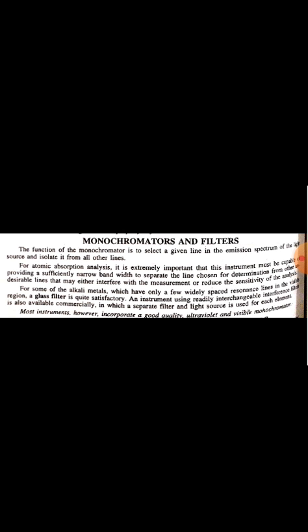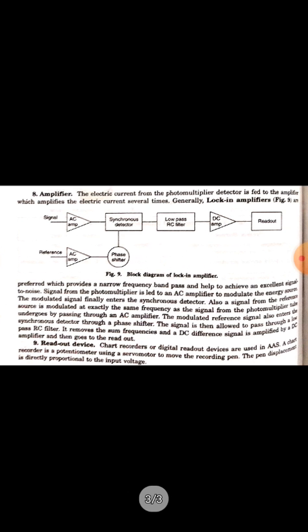Photomultiplier tubes are the most commonly used detectors. Dark lines are obtained on film whose intensities are compared. This comparison leads to accuracy but is difficult, with poor precision. A photomultiplier tube converts the radiant energy into an electrical signal. Both null point and direct reading meters are used, which are calibrated in terms of absorbance or transmittance. The next part of the instrument is the amplifier.